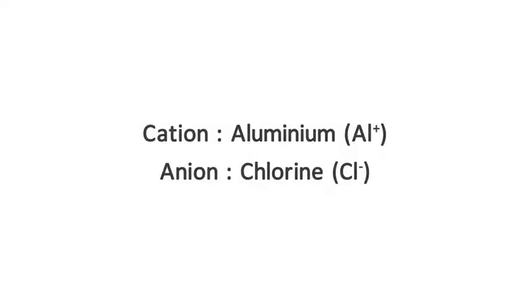With this analysis, we can infer that given cation is aluminium and anion is chloride.